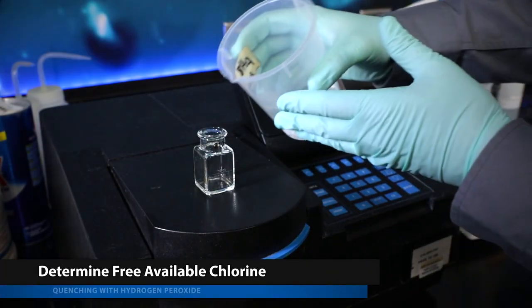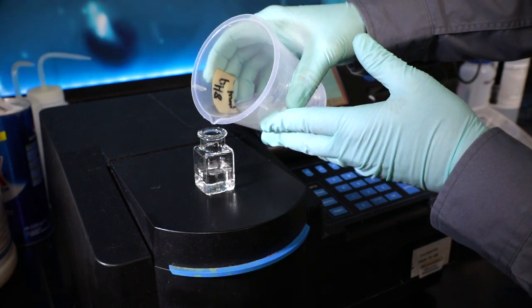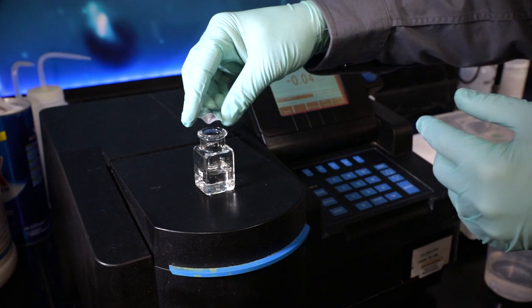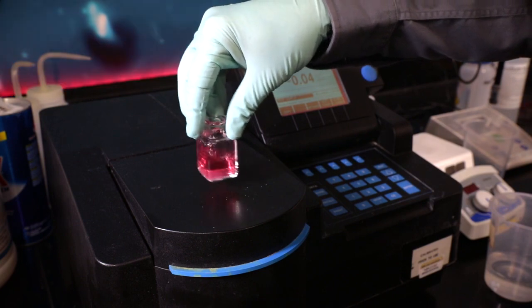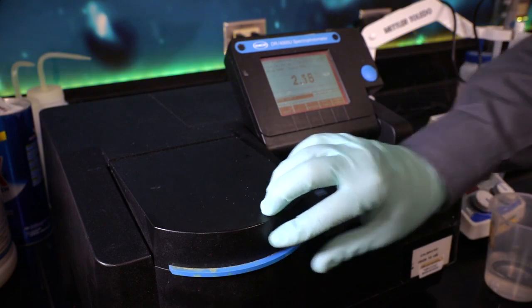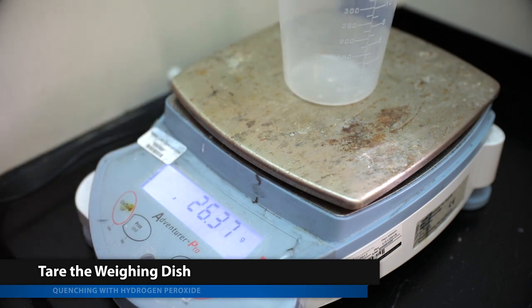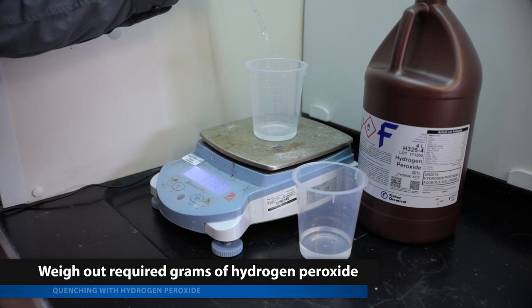Determine the free available chlorine in grams for the sample. If the actual cannot be determined, use the expected free available chlorine. Multiply the free available chlorine of the sample by 1.8 to obtain the mass in grams of 30% hydrogen peroxide to add to the sample. Set the sample to the side, tare the weighing dish, and using the pipette, weigh out the required grams of 30% hydrogen peroxide.